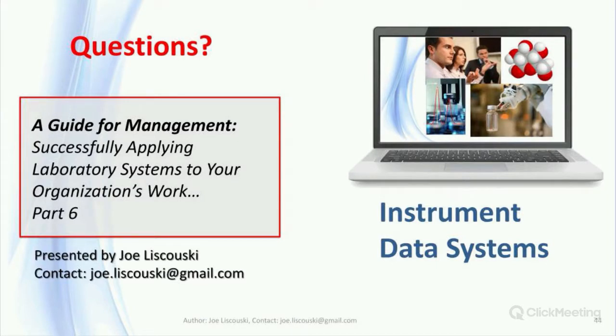Do those working in the lab need to understand the details of the software? That was another question that came in. Yeah. People don't have to understand what the program is all about. They don't need to be coders. They don't need to try and get into the programmer's head to figure out what they were thinking. But what they really have to do is understand what that programming is trying to accomplish. We touched on that a little bit already. What factors influence the processing of the data? Are there assumptions that can compromise your work?